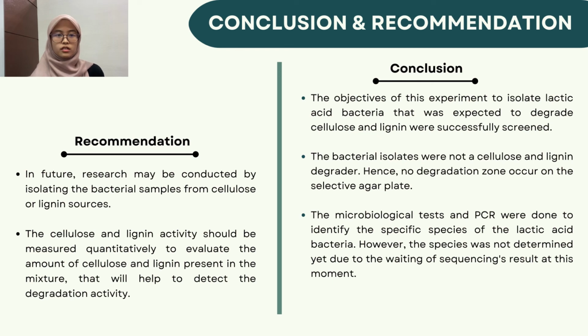For recommendation, in future, research may be conducted by isolating the bacterial samples from cellulose or lignin sources. The cellulose and lignin activity should be measured quantitatively to evaluate the amount of cellulose and lignin present in the mixture. That will help to detect the degradation activity.